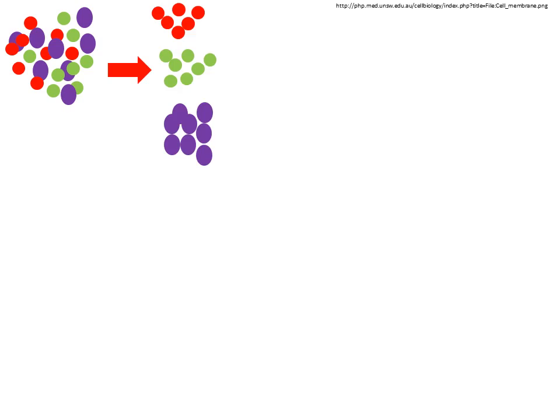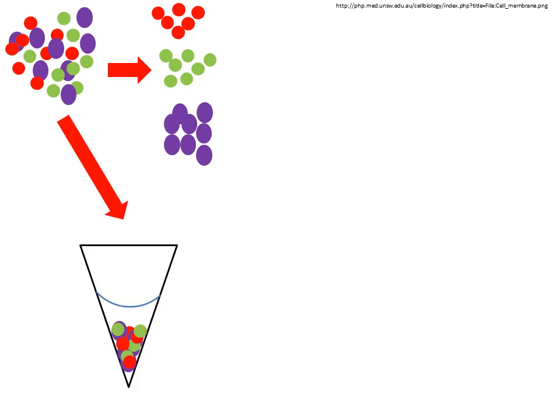Unless the protein molecules can freely move about in a liquid, the protein cannot be separated from other proteins, a necessity to reduce the complexity of a sample so that as many proteins as possible are identified and quantified. However, many proteins are poorly soluble, meaning that they don't stay in the solution or liquid, and can precipitate out of the liquid, meaning that they can't be analysed.